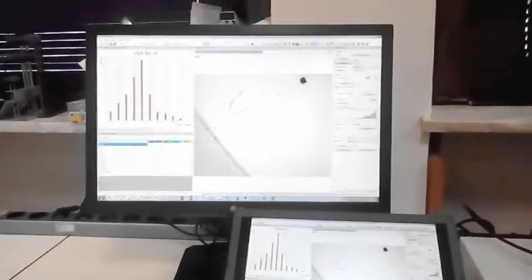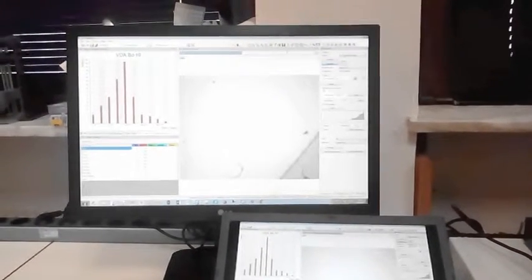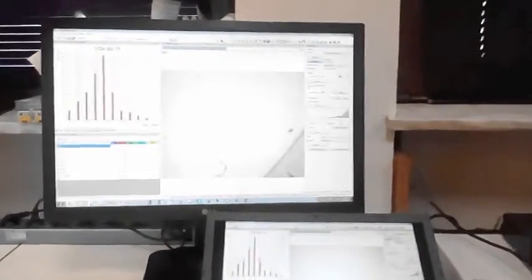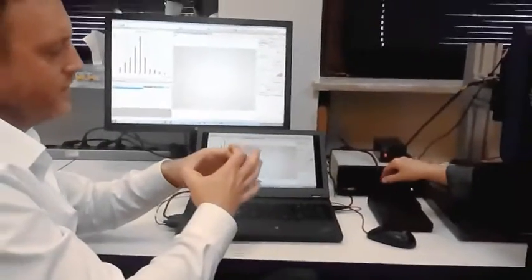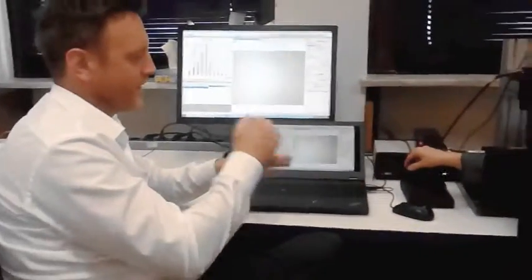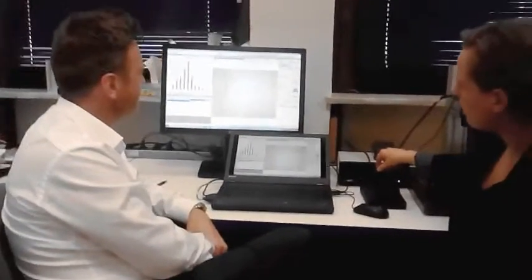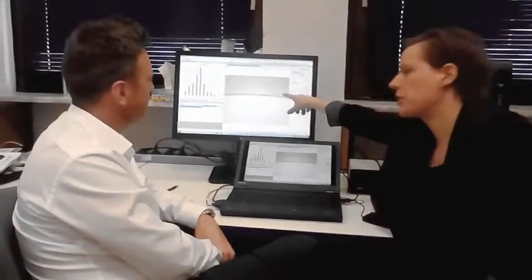Then the second one, and the third one. Good. Now you can see we nearly reached the 47 standard. The software now knows exactly where our circle of filtration is, and exactly where to start that scan run. Going to the edge, a red line appears, which shows you your filter area.